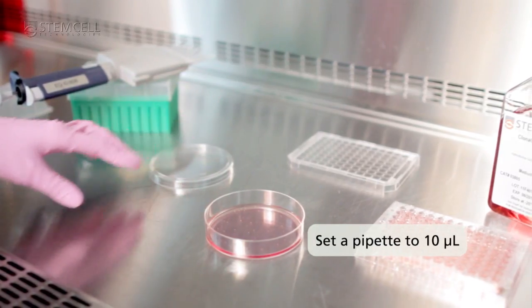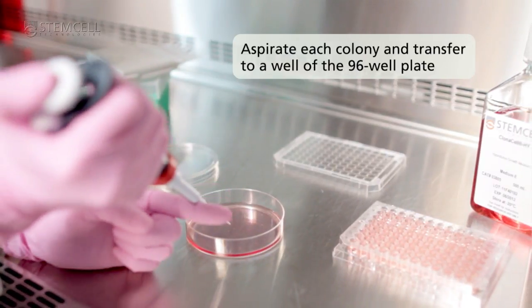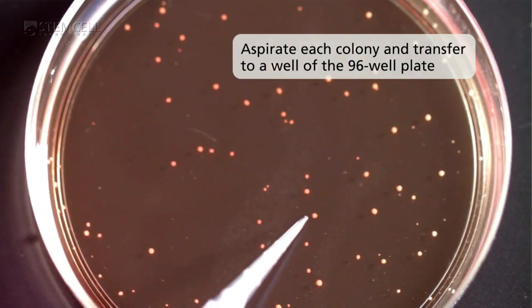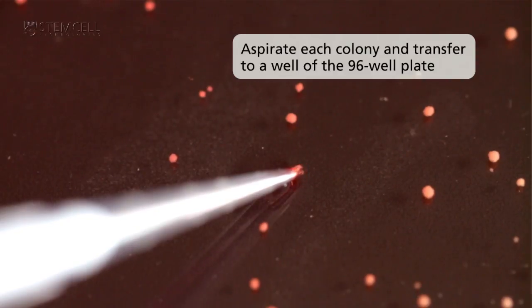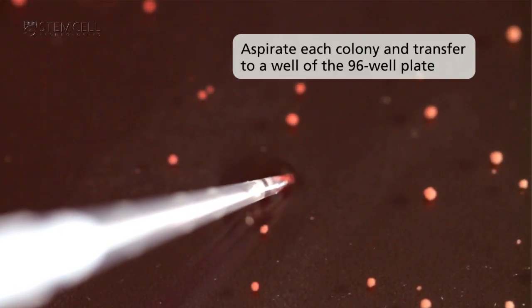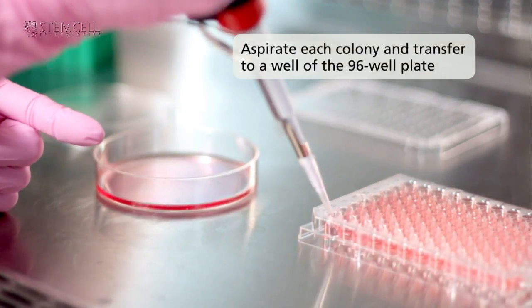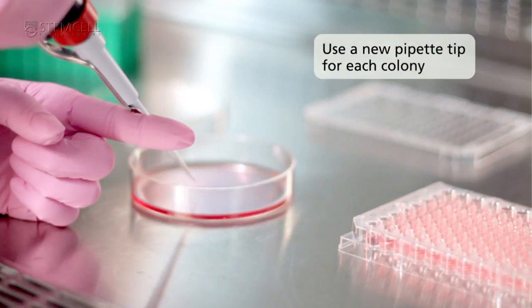Set a pipette to 10 microliters. Using a sterile pipette tip, aspirate each colony. Transfer it to a well of a 96 well plate. Use a new pipette tip for each colony.